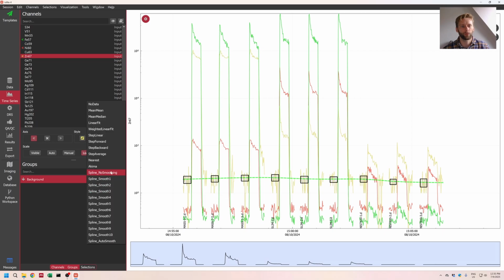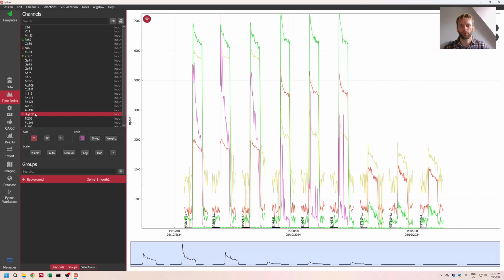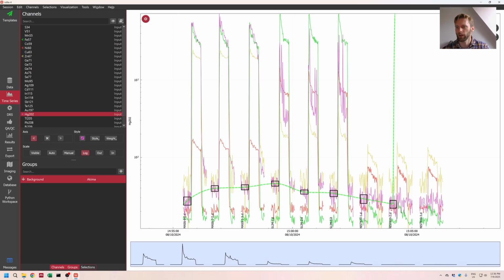No, it looks pretty well behaved. Maybe I'll just select an element that's probably more of a problem. Here, this is curved, but this still looks okay. I could try deleting one. That might, yeah. So that makes it go crazy.